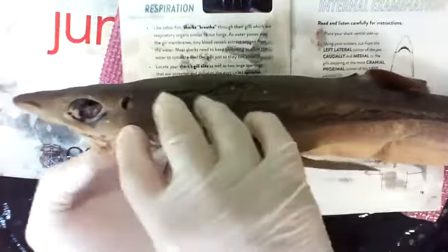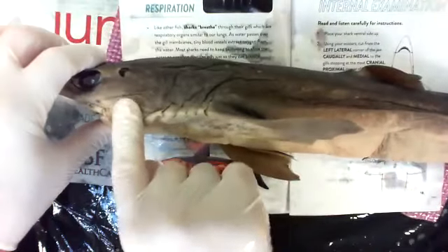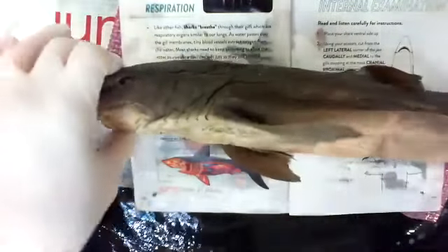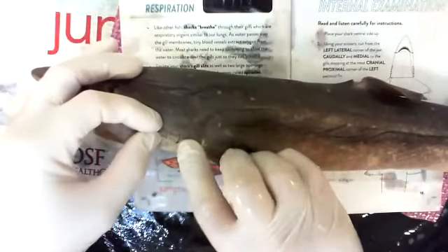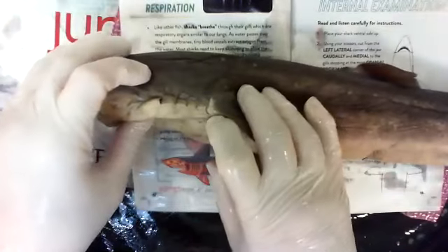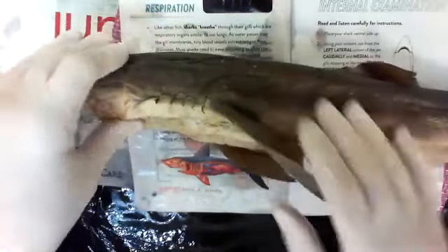Again, if you can Google an image or a video of it, it's weird because it's like they're going, oh my gosh. They're sitting there pulling in water, flushing it over. It's like they're having an asthma attack or something underwater, but they're actually comfortable breathing. If you look at the number of gills, there's 1, 2, 3, 4, 5 on mine, 5 on the other side. Most sharks have 5. One exception is the 7-gilled shark, and I kid you not, that's its name. Wonder how they came up with that one. Yeah, it has 7 gills.